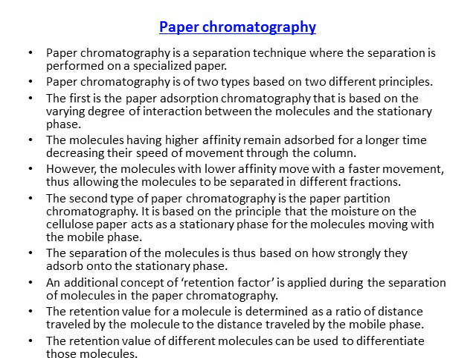The next is paper chromatography. It is a separation technique where the separation is performed on a specialized paper. It is of two types based on two different principles. The first is paper adsorption chromatography.